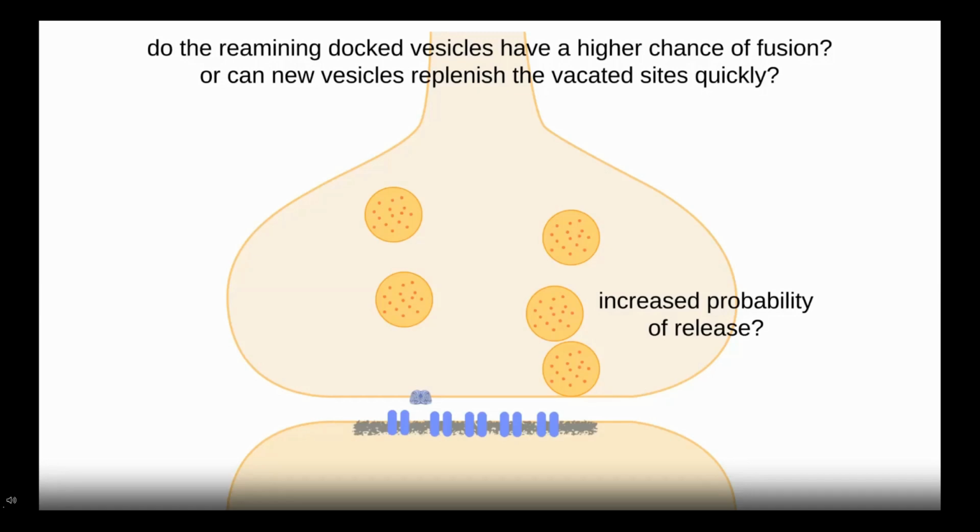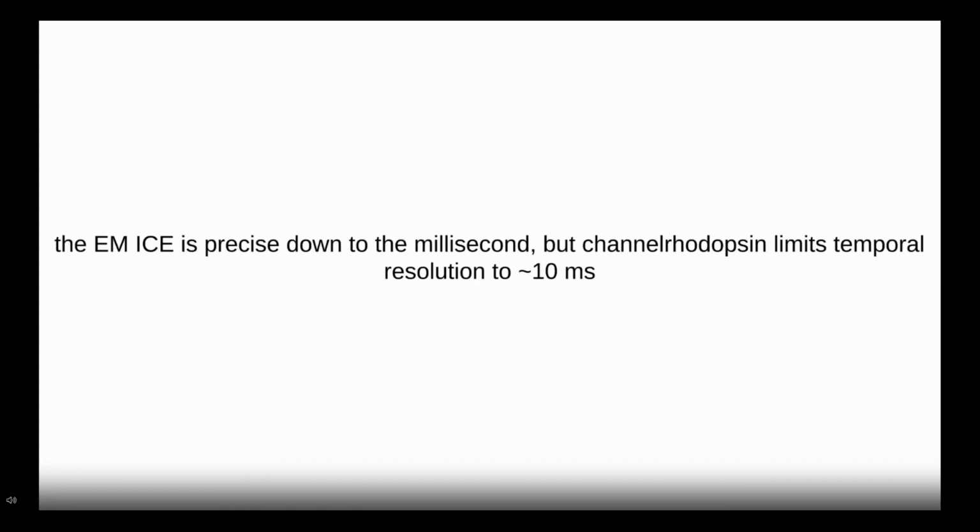So what we thought about is, in principle, a very simple idea. What if you just have recovery of vesicles that's quicker? You have vesicles that dock in really quickly. But again, this isn't what Shigeki saw with his experiments, right? Docking took about 10 seconds to come back. But here again, we come to a technical limitation, which is that while flash and freeze by itself is really impressive, at this time scale there could still be things we're missing.